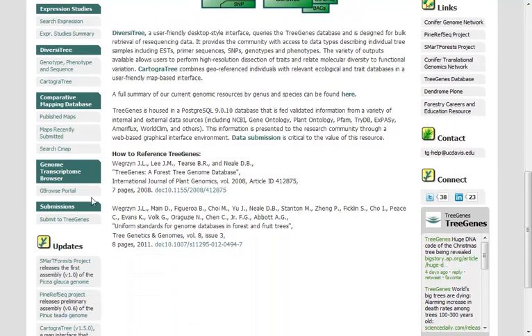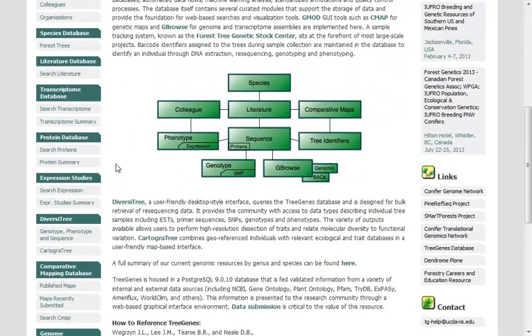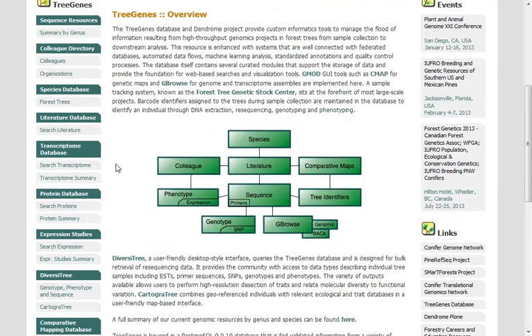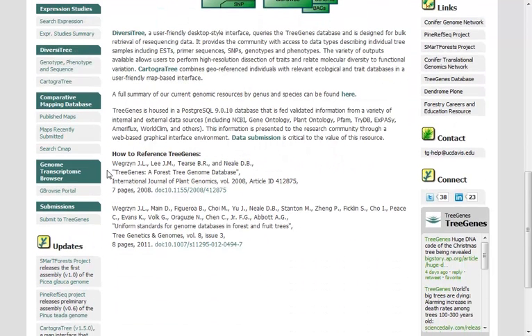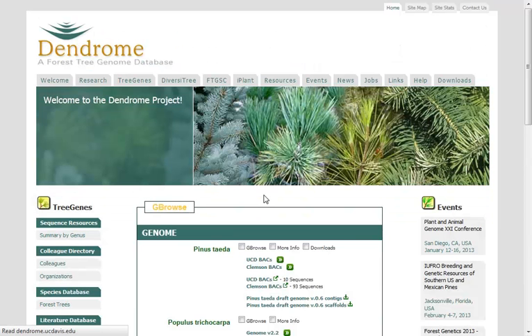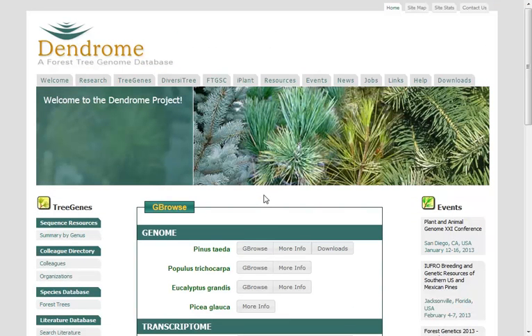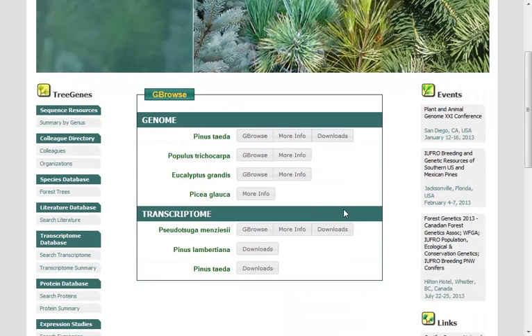And so what I'll be focusing on is this GBrowse portal that they have here. But you can see there's a tremendous amount of information from a number of different strategies that are coming into this Tree Genes site that might be useful for you. I'll be focusing on this genome transcriptome browser GBrowse portal just because I like to highlight how often people are using GBrowse for their specific projects.